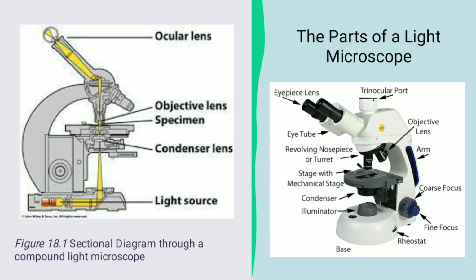So, this is how a light microscope or optic microscope looks like, no? As you can see on the illustration. The two diagrams or illustrations that you can see on your screen, do not be confused, all right? These two are just the same. The diagram on the left side of your screen, I got from our main textbook, and the diagram on the right side, I got from the internet. I specifically included this one because it includes the entire parts of a light microscope. So, para mas maklaro na to.